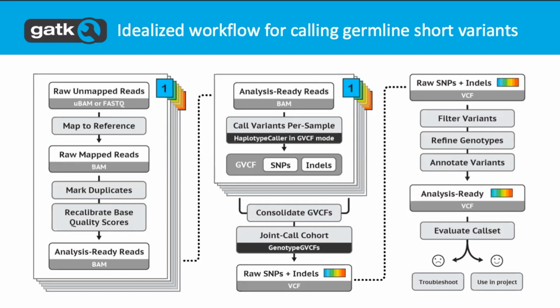There's a little bit of variation introduced by what you're using as a reference. If you're always using the same exact unrelated samples, that's fine, but you can't just add more as you get more coming into your facility, because that changes the results for a patient. That gets into the regulatory side of things. It depends on what the approval process looks like for your pipeline.